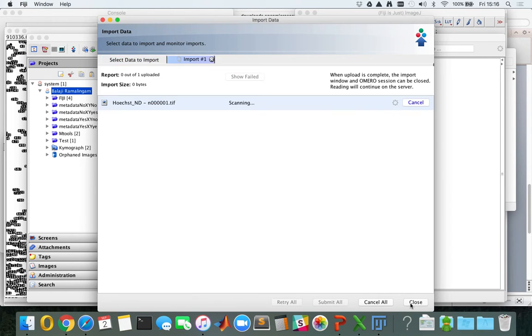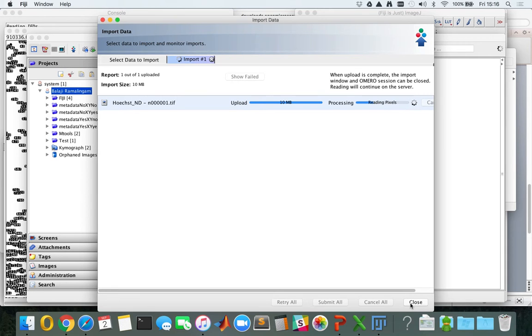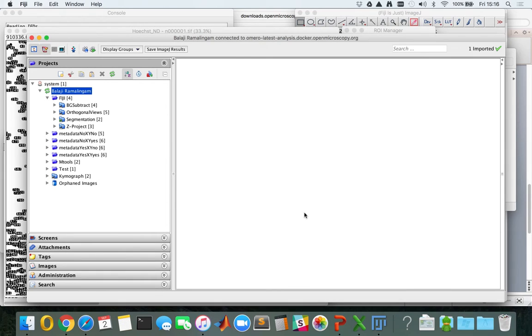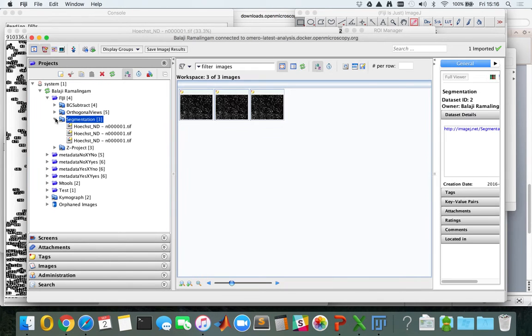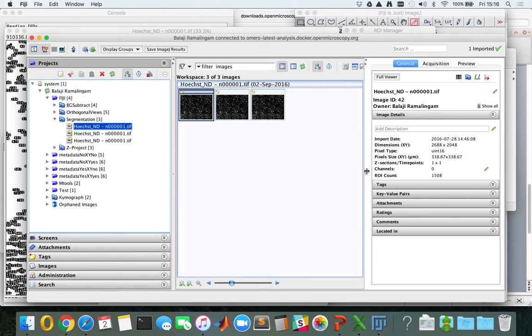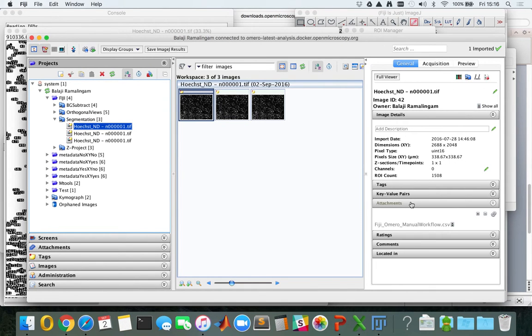Now I'm importing the image. As you can see it's really quick since it's just a single image with a single plane, but it contains 1500-odd ROIs and the results table.